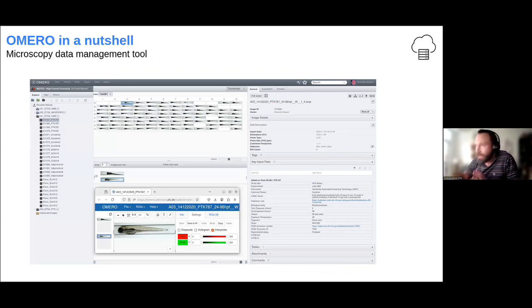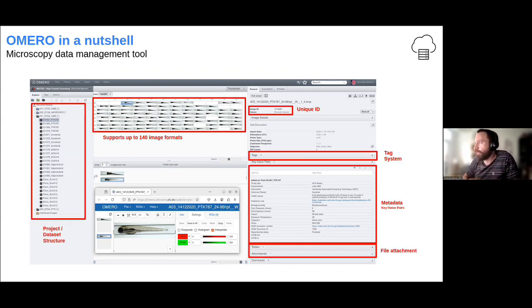OMERO, in a nutshell, really fast intro, is a microscopy data management tool, and it's a pretty cool one because it allows you to share data, to annotate them, and to structure them in a certain way that helps you with your daily research data management with images. Just to give you this fast overview, images have a unique ID, so you can really link a single image to a specific number.